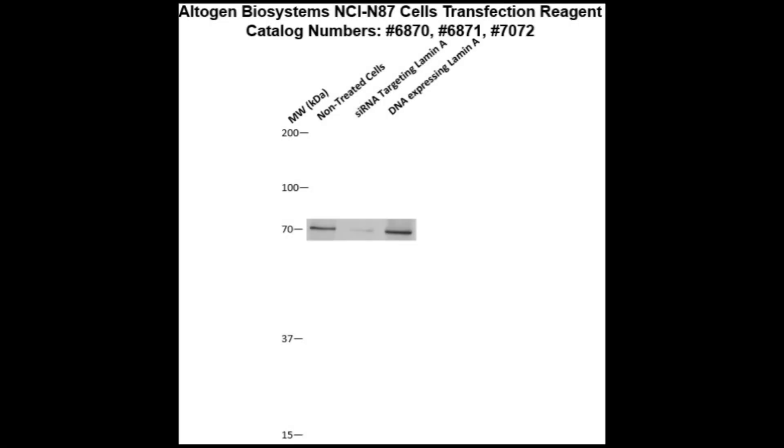Here is a Western blot validation of our transfection reagents on NCI-N87 cells transfected with either Lamin A DNA, which resulted in overexpression as compared to non-treated cells, or Lamin A siRNA, which resulted in partial silencing.